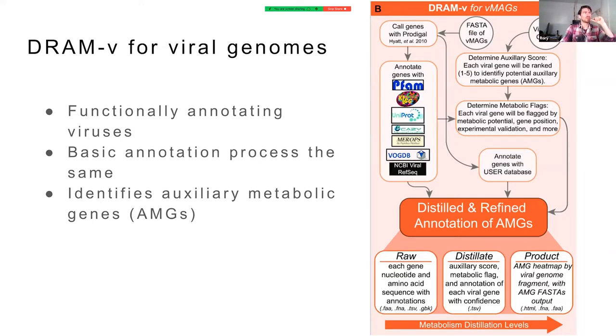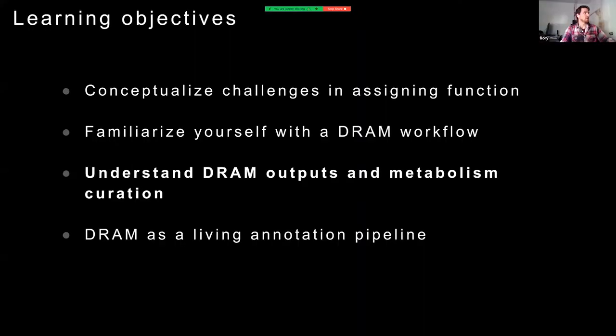And also, we integrate output from VirSorter, as mentioned earlier, to help us determine and rate our metabolic AMGs to try and better understand how the viral community is affecting the metabolism of the broader microbiome community. So this will be joined into DRAM 2 in a way that I think will be very elegant. But for now, DRAMV is a separate tool that I hope people also try out. And now I believe it's time for me to pass back to Michaela.